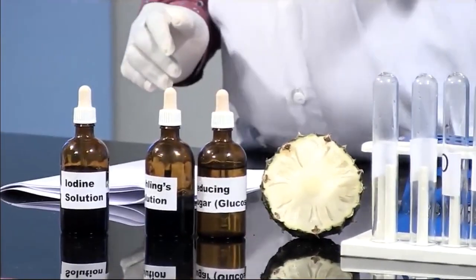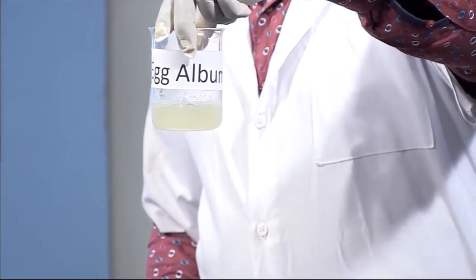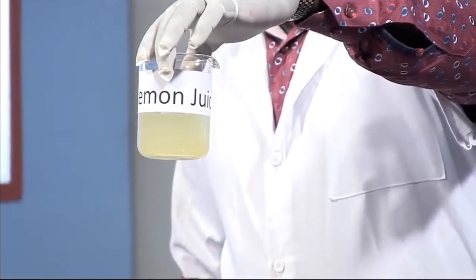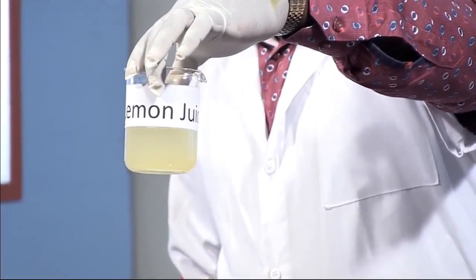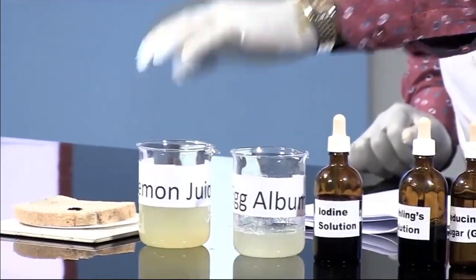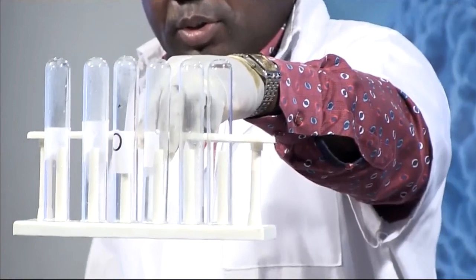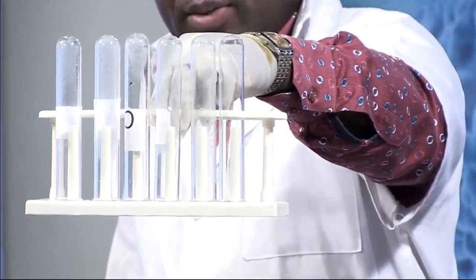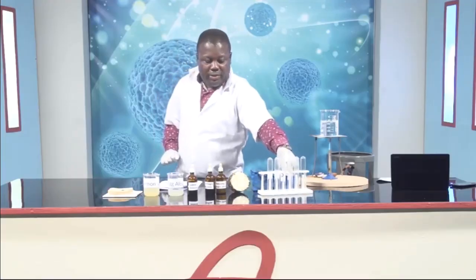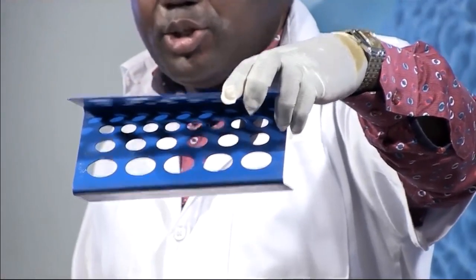We also have our egg albumin, then we have our lemon juice. Both will be used as controls. We have our test tubes here, already labeled A, B, C, D, but we use A to C. We have our rack, where after the experiment we'll place the contents of the test tubes.